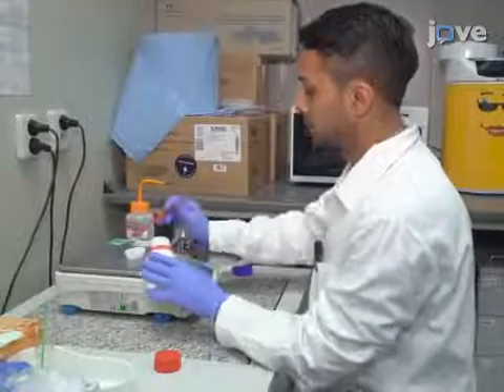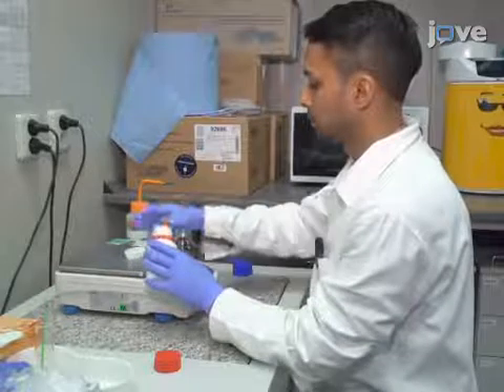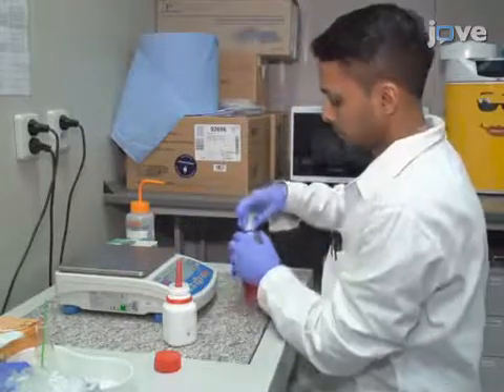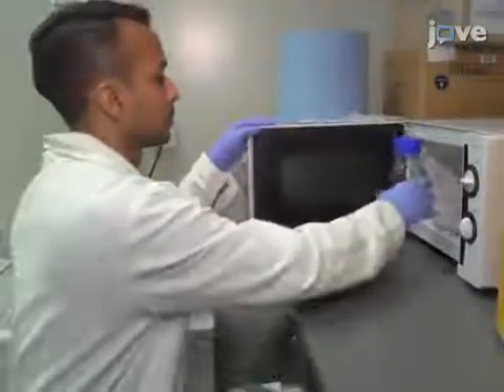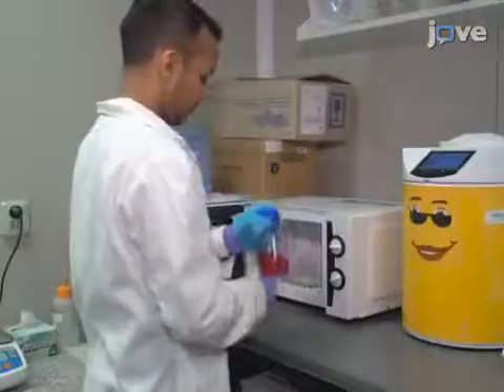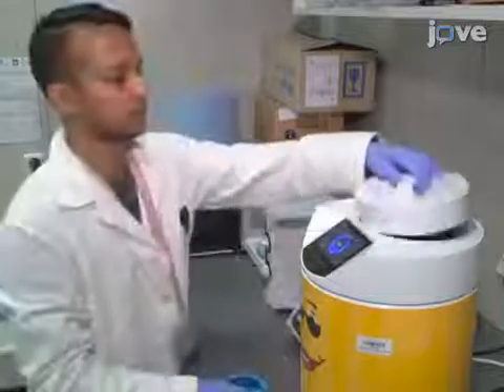Begin this procedure by weighing out 0.75 grams of low melting point agarose and add it to 100 milliliters of McCoy's 5A medium with or without phenol red and without serum. Heat the solution in a microwave and swirl it every 1-2 minutes to completely dissolve the agarose, then autoclave the solution to sterilize it.